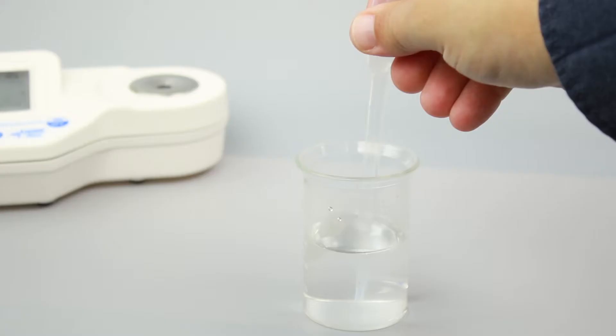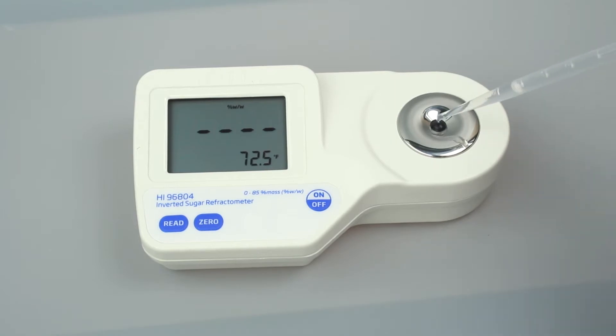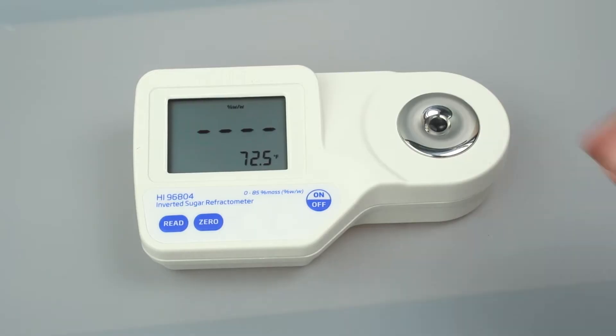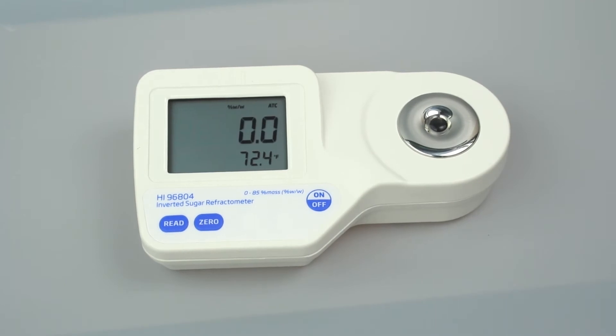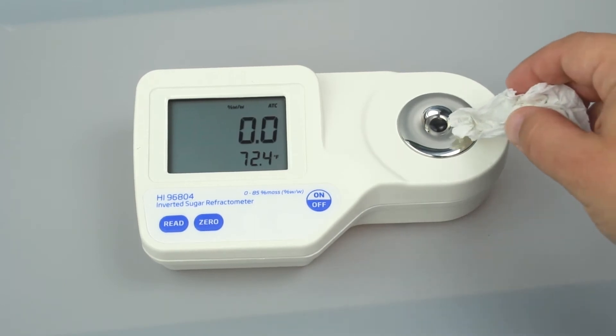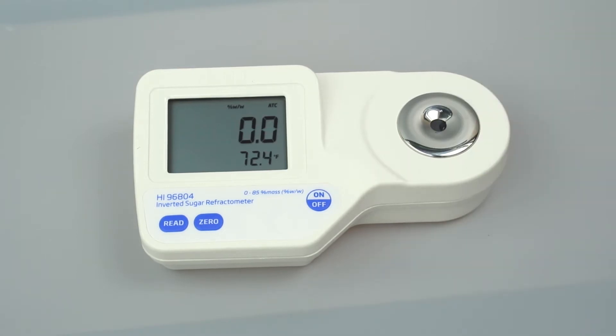Calibration is essential for refractometer operations and takes just a few seconds. We recommend calibrating before each use. To calibrate your refractometer, fill a plastic pipette with deionized water and cover the sample prism with just a few drops. If there is a strong light source nearby, cover the prism with your hand. Press the 0 button. Once 0 appears on the screen, use a soft tissue to absorb the deionized water off the prism. After calibration, the refractometer is ready for measurements.